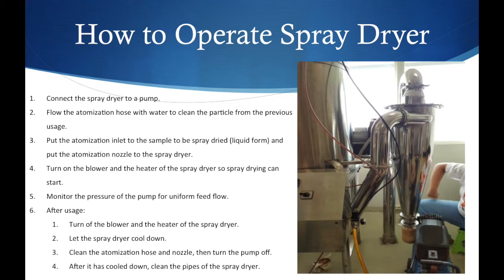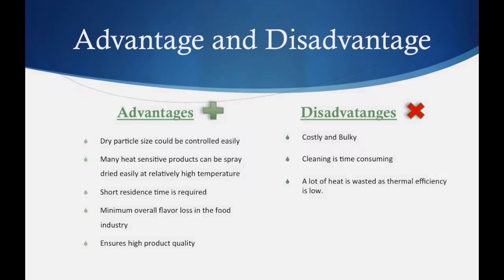After usage, turn off the blower and the heater of the spray dryer. Then let the spray dryer cool down. Clean the atomization hose and nozzle, then turn the pump off. After it has cooled down, clean the pipes of the spray dryer.